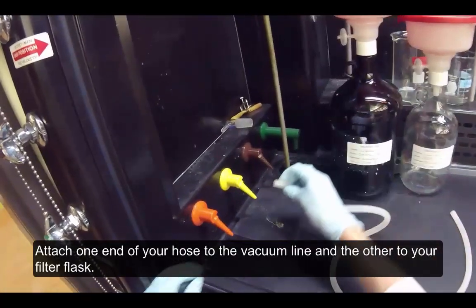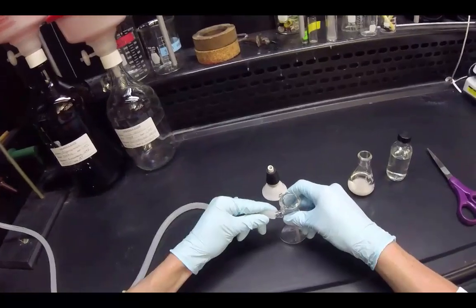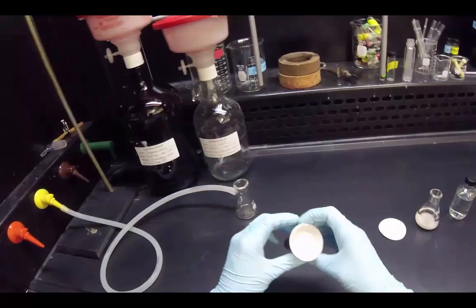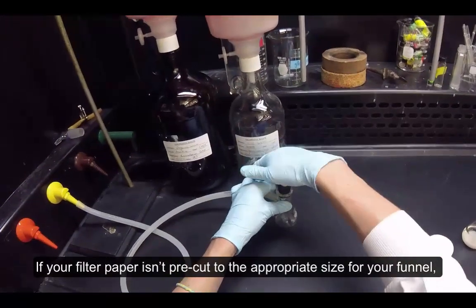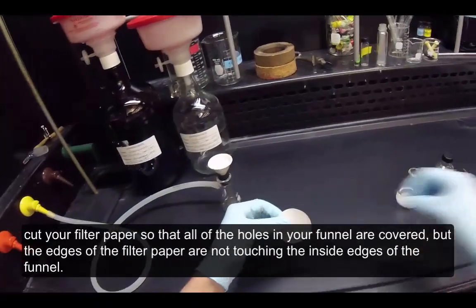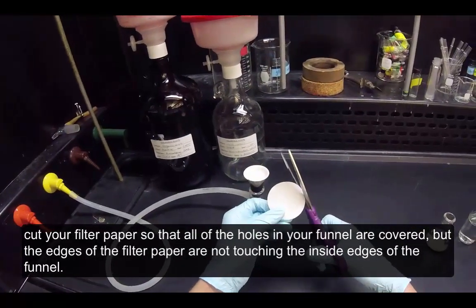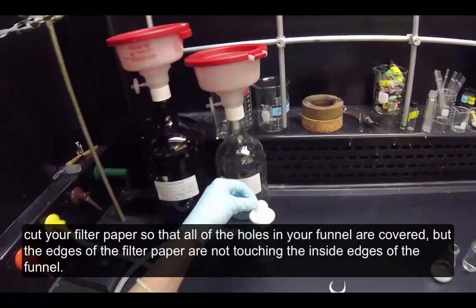Attach one end of your hose to the vacuum line and the other to your filter flask. If your filter paper isn't pre-cut to the appropriate size for your funnel, cut your filter paper so that all of the holes in your funnel are covered, but the edges of the filter paper are not touching the inside edges of the funnel.